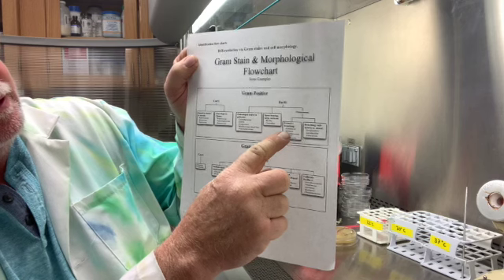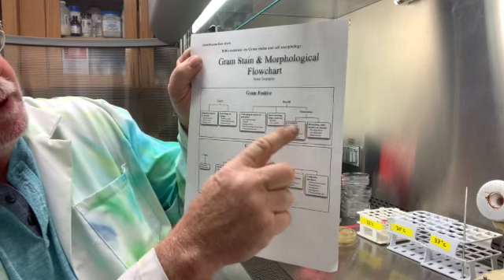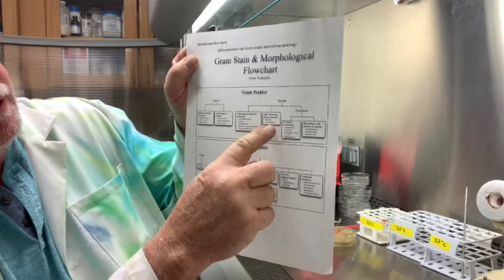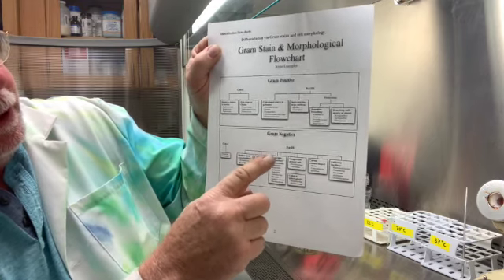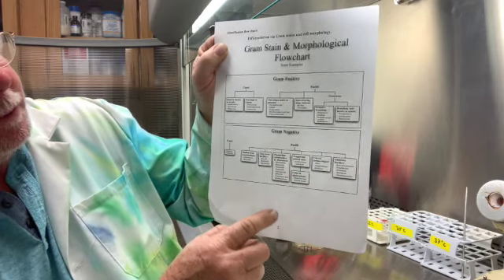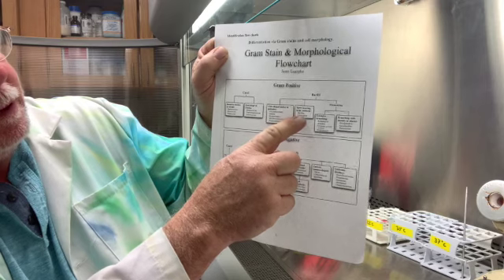It was pretty uniform. Extensive branching, nope. And so this means that we're probably dealing with Bacillus or Clostridium genera. Okay, if it's gram-negative, we would go down to here, look at those, and see which fits best. And so we're going to deal with Bacillus and Clostridium bacilli.